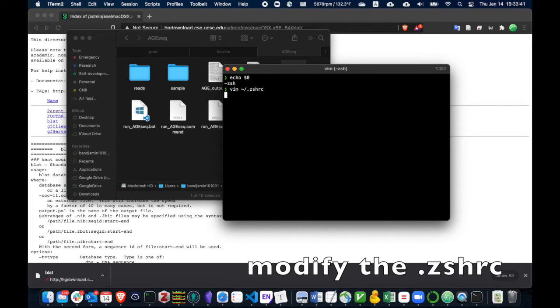If you are going to edit a file that does not exist, vim will create one for you. And if it already exists, it will just edit the file. For the first time user, it is possible that you did not have a zshrc file already. So using this command can make sure you create the correct file.